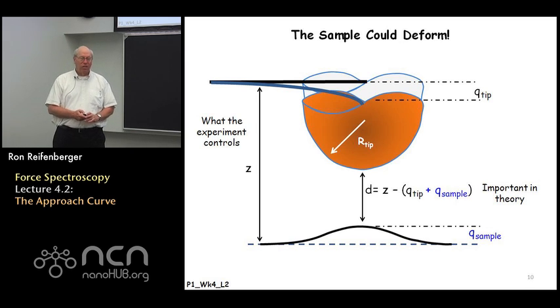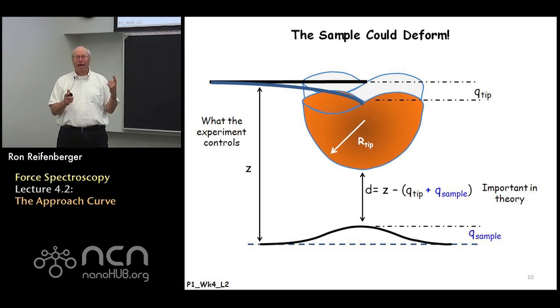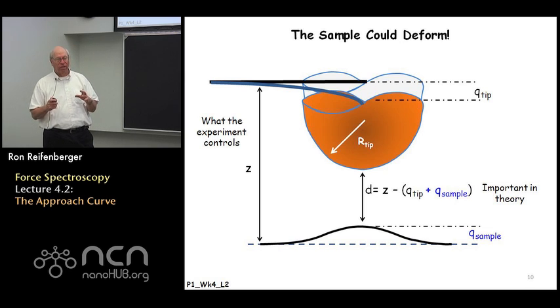So that's all I wanted to say about trying to understand this very fundamental force versus displacement curve and how to convert the force versus displacement curve into a force versus gap, or force versus distance between the tip and the substrate. That's the fundamental thing. This is the initial attempt to describe that whole process.